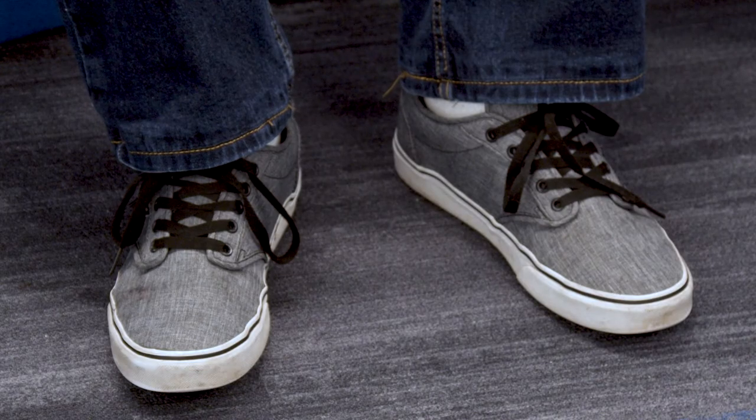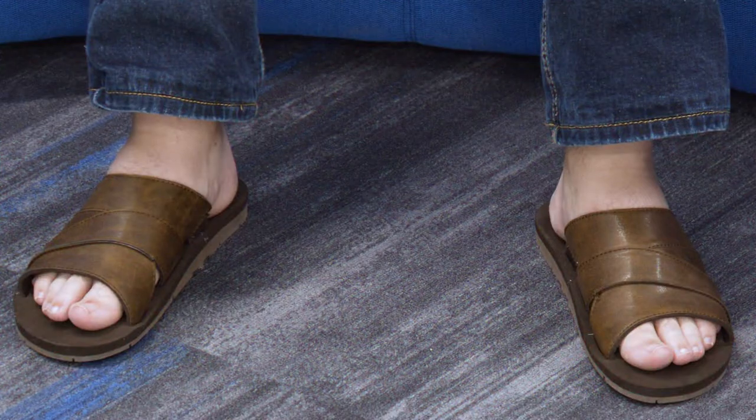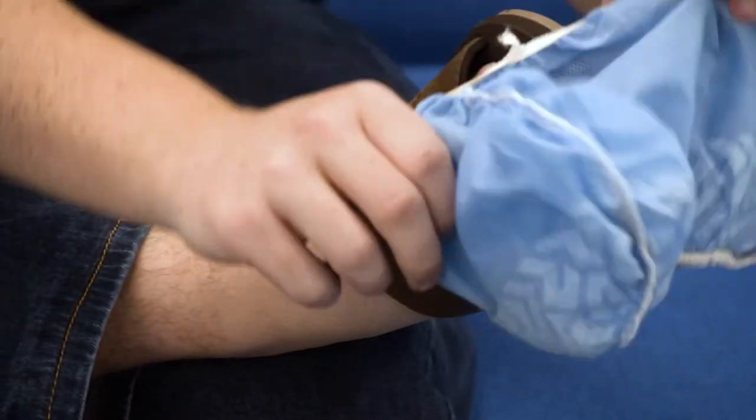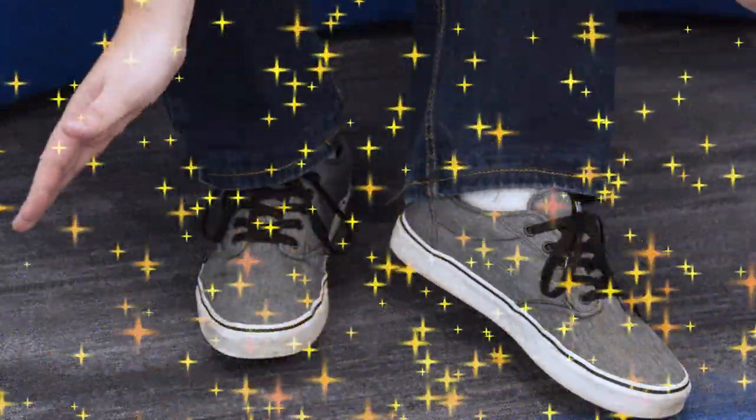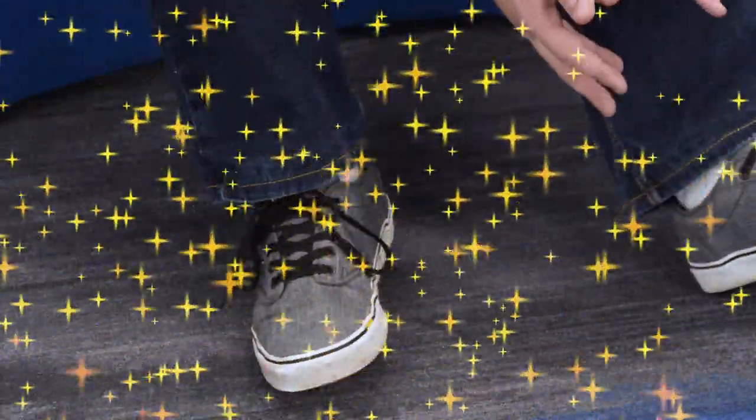Make sure that you're wearing closed-toed shoes. And if you don't have closed-toed shoes, you can use booties to cover your feet while in the lab. Sometimes scientists work really long hours and standing can be uncomfortable, so make sure that you wear comfortable shoes while working on your feet. Protecting yourself is important. Although simple, following appropriate PPE protocol goes a long way — it is the best thing to do to protect yourself in the lab while working.